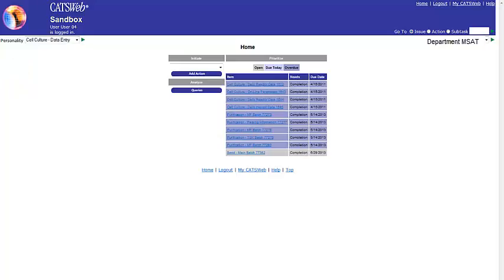Our first job is to add the cell culture main batch record. This is called an action. You can do that right from the classic homepage. Use this drop-down menu, select Cell Culture Main Batch, and click the Add Action button.